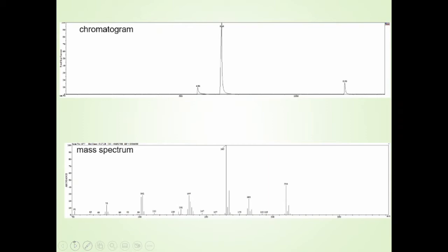If you look up here, and this is pretty tiny print, I apologize for that, but that tells you which scan number it is. But the important thing is retention time here. I think I have them set so that all of yours, the retention time here should match what's written up there. The default setting is for it to report the mass spectrum in minutes and seconds.